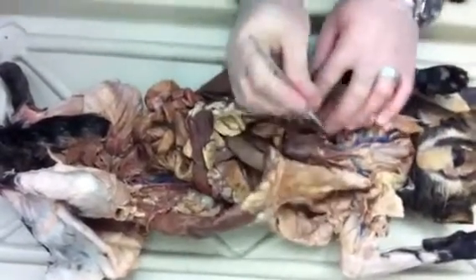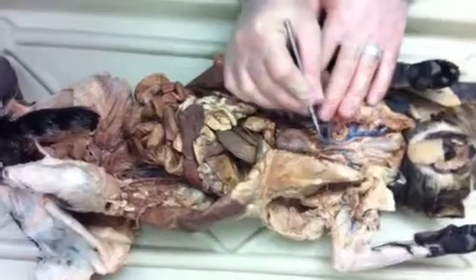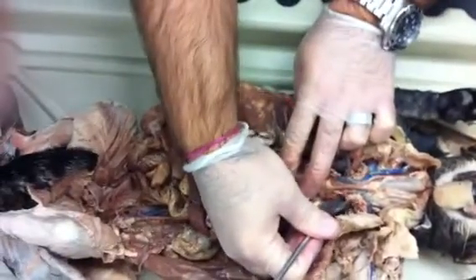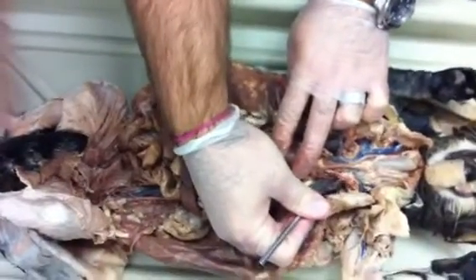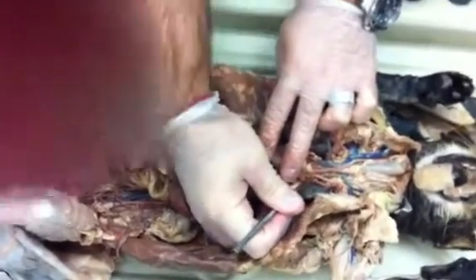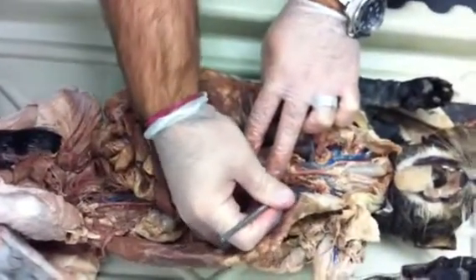Coming out of that, we have the brachiocephalic trunk, right? That's the main vessel over here on the right. And on the left, we have the left subclavian artery coming out. So there's only two vessels that leave the aorta, and those were the two: left subclavian and the brachiocephalic trunk.